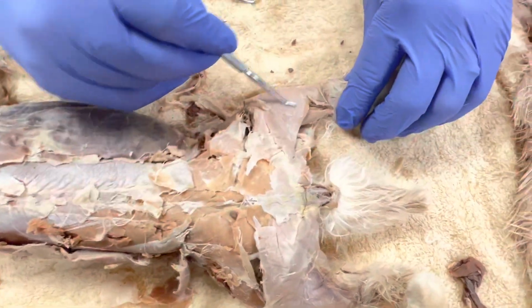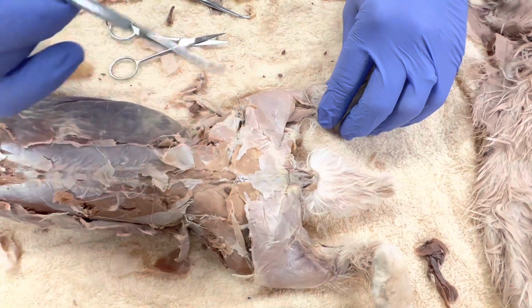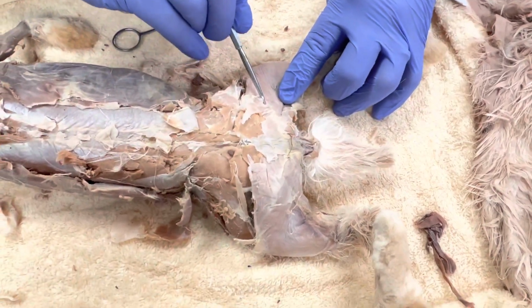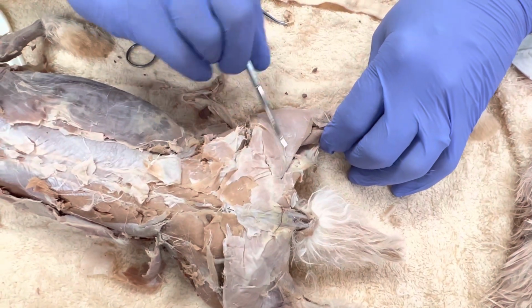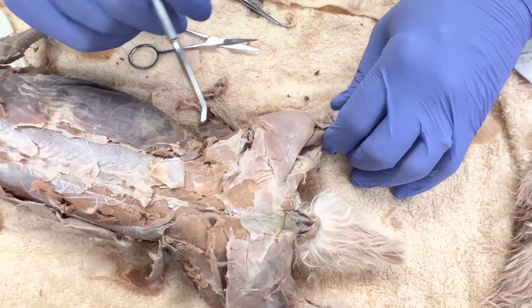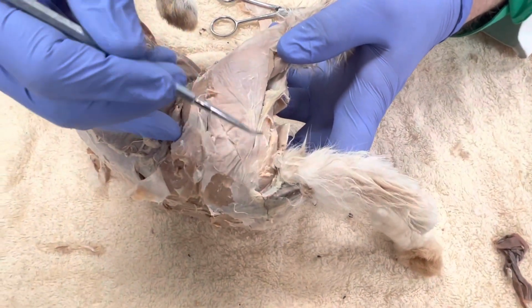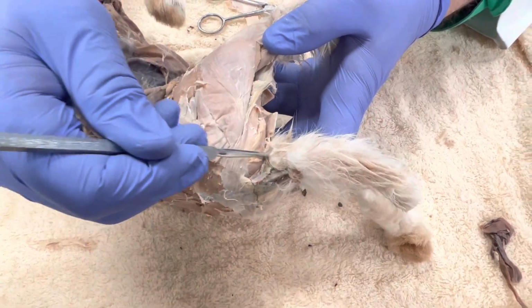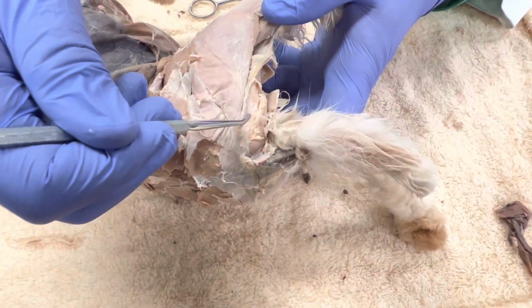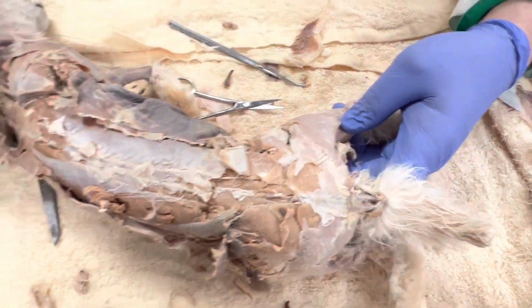This whole muscle right here is my biceps femoris, right? And the biceps femoris is actually in two parts. If you notice, there's a little line right here. This is the biceps cranialis, and then down here would be the biceps caudalis. And then if I look right here, I have my semitendinosus and my semimembranosus. So the semitendinosus, the semimembranosus, and the biceps femoris make up my hamstring muscles.